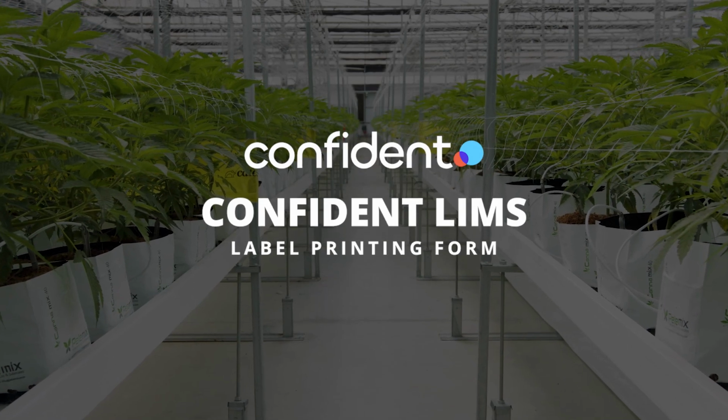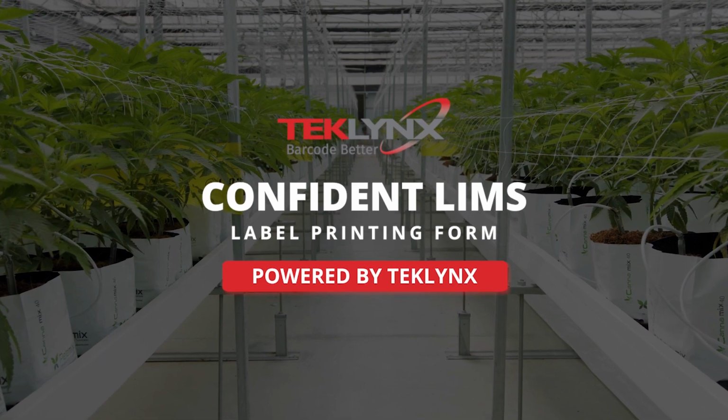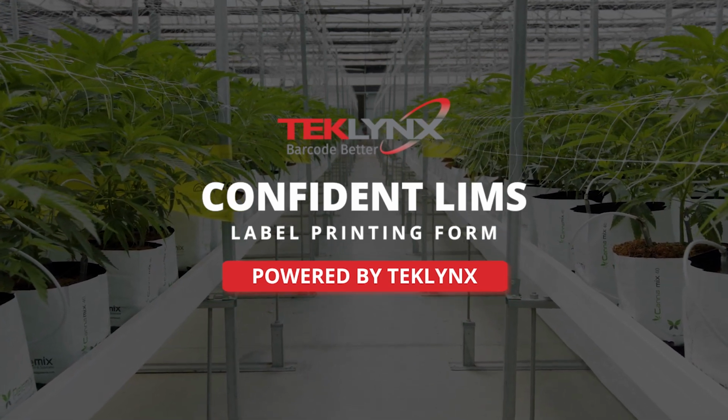Today, I wanted to do a quick walkthrough with you on our integrated printing form that we made in collaboration with Confident Cannabis. After speaking with a lot of our customers, we found there was a huge gap between the data that needs to go on a label and the actual act of putting it on the label.